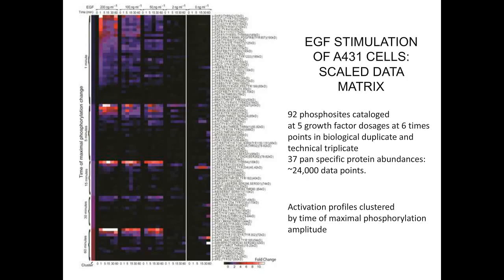And how also would they respond to difference in growth factor signaling networks, or different growth factor signaling levels? So this is a very busy slide, and I apologize for that, but we were quite proud at the time at the ability to track so many modification states of important signaling network proteins. And that's what I show on the right of the chart, all of the different phosphorylation states that we were following at the same time.